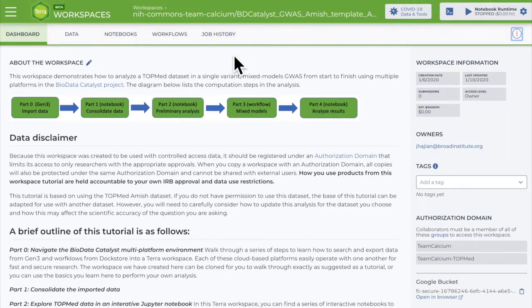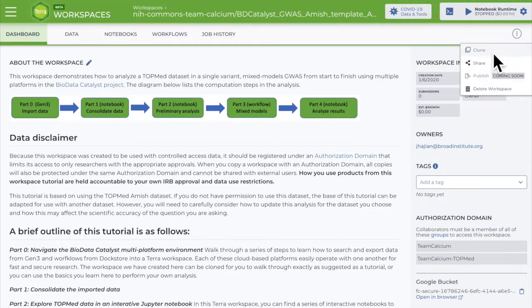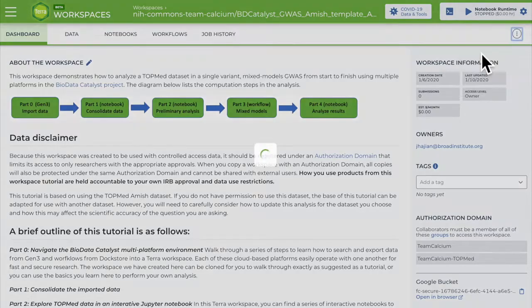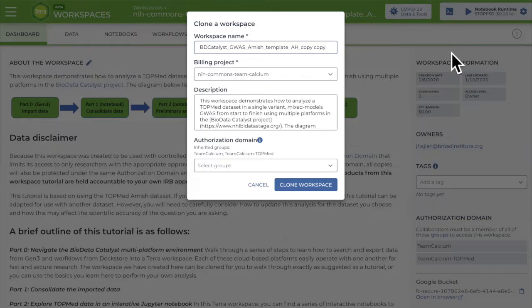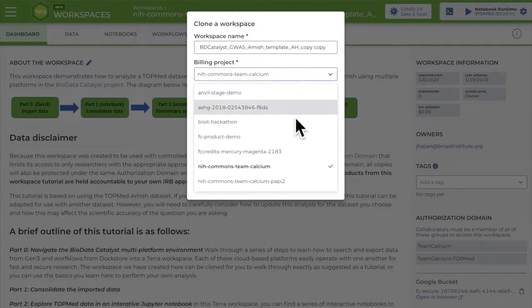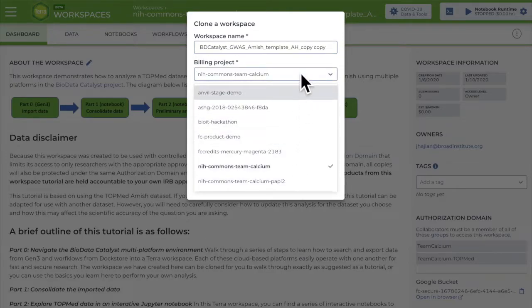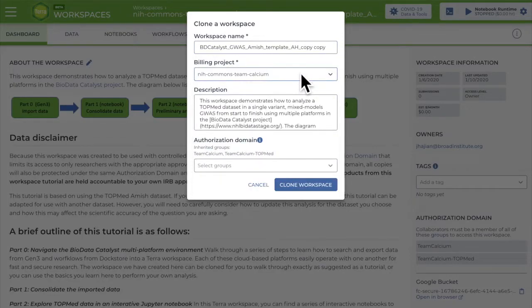You can also duplicate or clone a workspace, which creates a fresh copy with the same tools and data, but no job history and an empty workspace bucket. This might be useful for testing analysis code, for example, or if you want to change the billing project associated with your analysis. You can do that by clicking on the three vertical dots again and selecting Clone instead of Share.